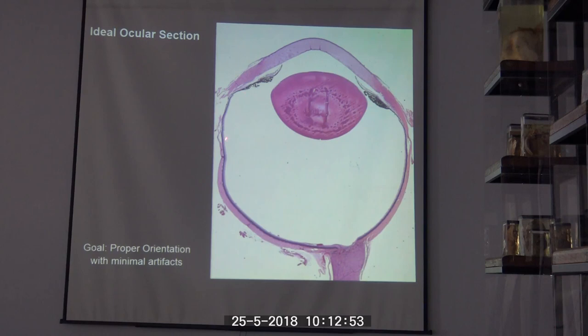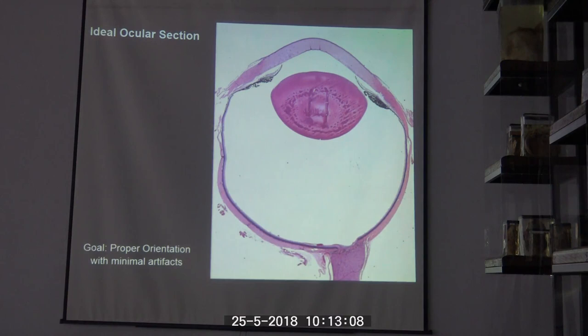Even in this ideal section you can see that we still had some tissue tearing and loss. But hopefully as I give suggestions on what to do at each step of the process, you will be able to come to an end product that looks pretty much like what we have here. So let's get started.